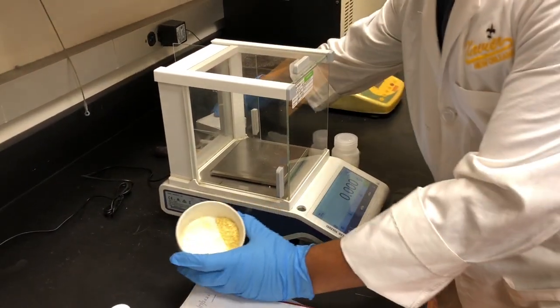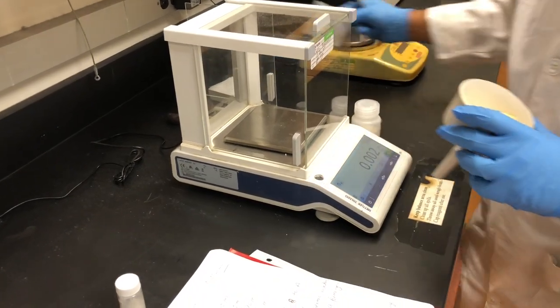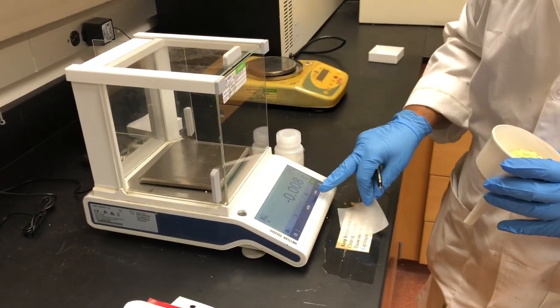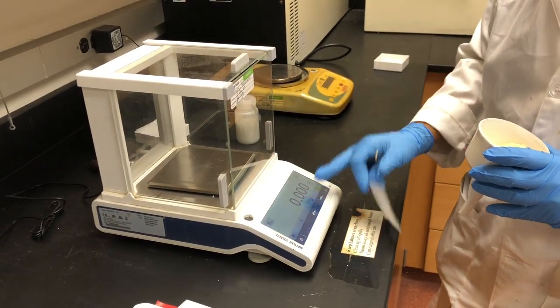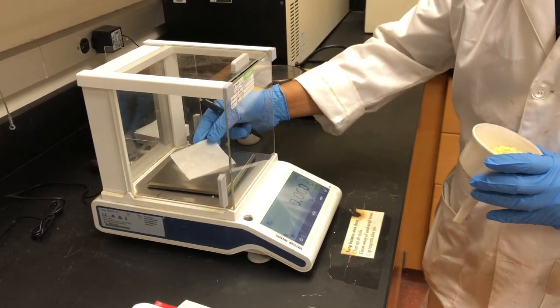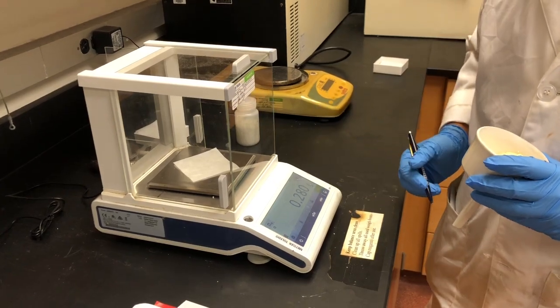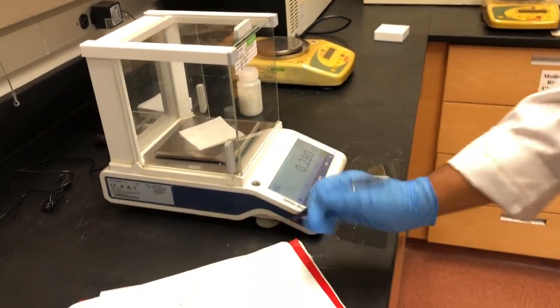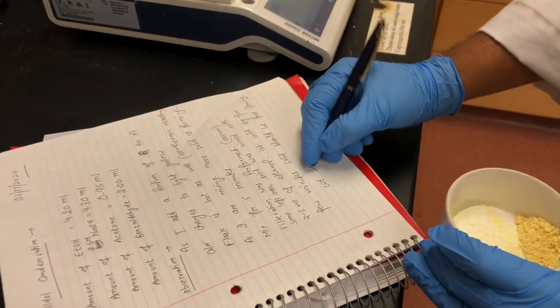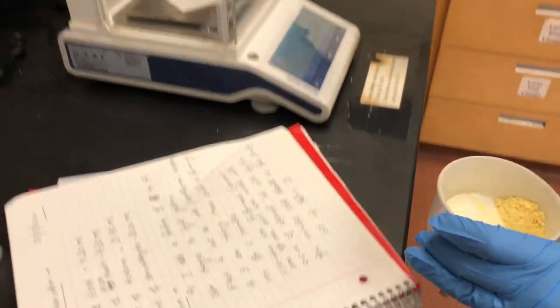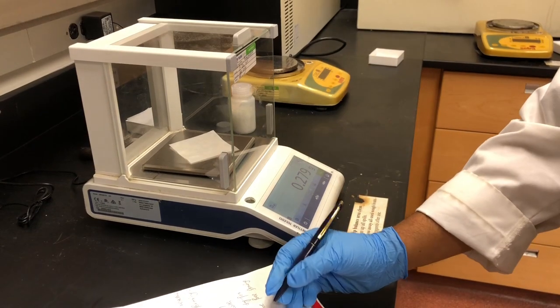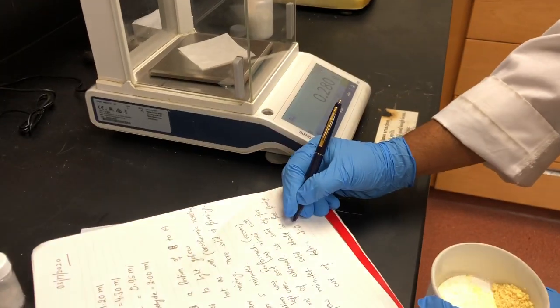So, what I am going to do is, first, I tare the machine to make sure it is zero. Then I am going to put a weighing paper and going to write down the weight of paper in my notebook. Make sure you close the weighing machine.